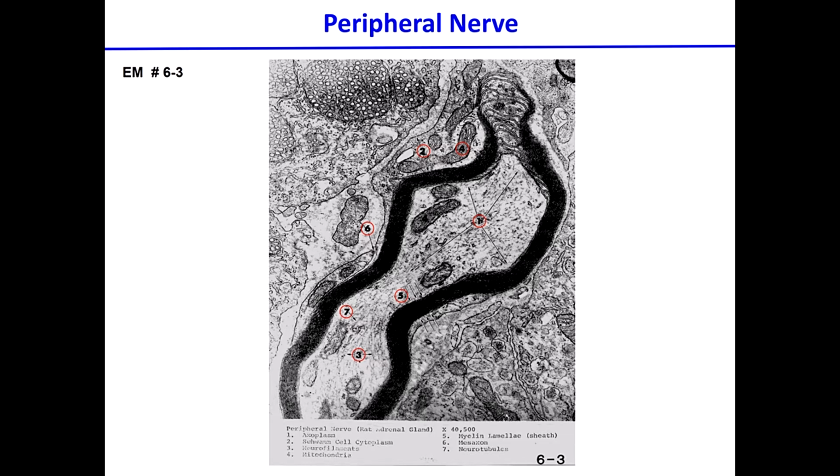Remember that there was a slide that we showed you in the class that when one Schwann cell wraps only once, the two ends of that wrapping action are going to get to a point that they touch each other and they form this kind of gap. It's called mesaxon. Does anyone have any suggestion of what this may be? What do you think is in there? Vesicle. So what could it be related to, right? Could this be the portion of a presynaptic cell? Okay, good. Questions?